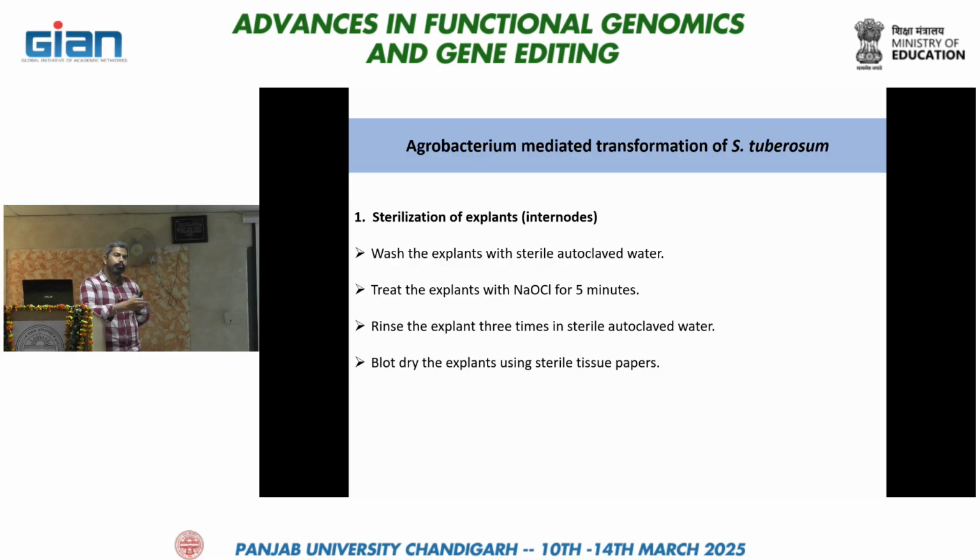Yes, we have to follow multiple steps to ensure that our explant is free from any contamination. It's not that hard. It's not like you have to follow exactly these steps; it can be more tuned as well. But if the contamination comes in the later stages, it will ruin your complete experiment. So I have mentioned these few steps extra.